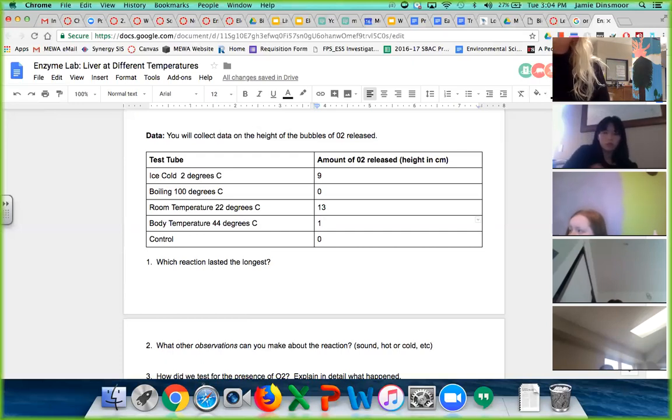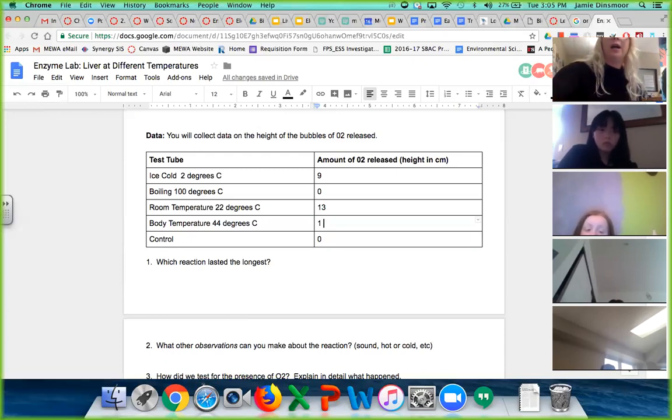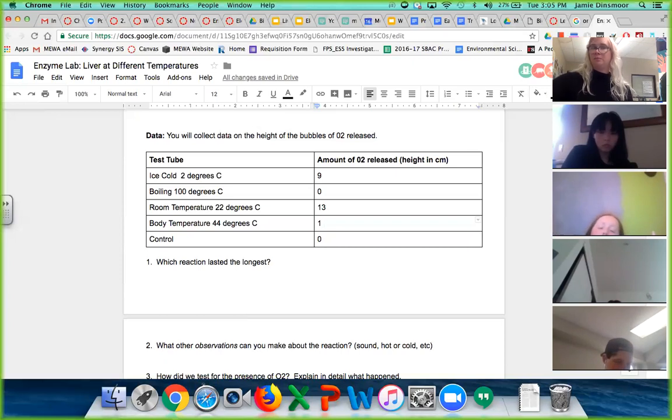Because as you notice, not everything works out perfectly in an experiment, right? Sometimes we know something should happen and it doesn't. So now let's get back to proving. Okay, we're gonna be proving this using some fire. What's the relationship between fire and oxygen? Fires need oxygen, right? When a fire gets oxygen, it fuels it.